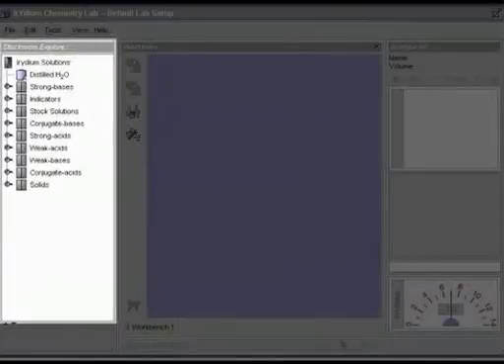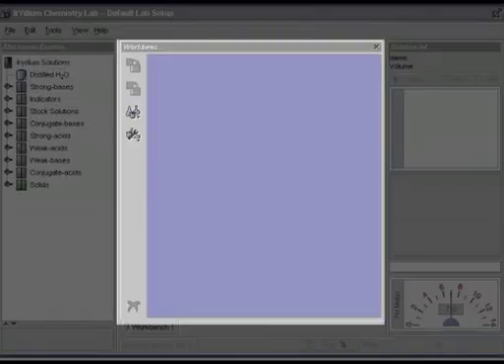From the Stock Room Explorer, you can access the chemicals needed for your experiments. The chemical workbench is where you conduct your experiments.